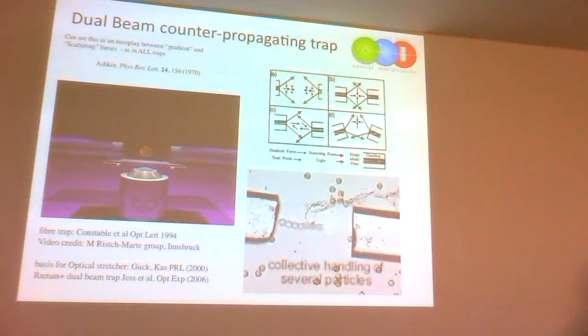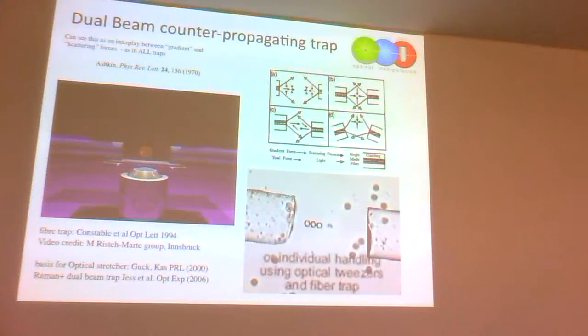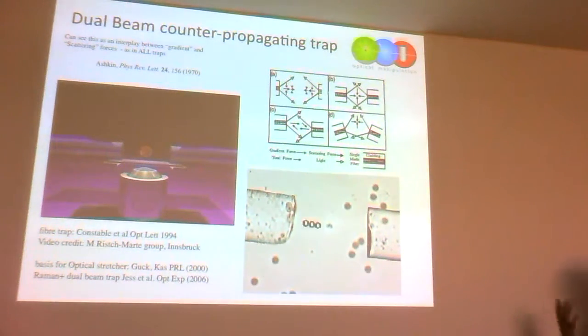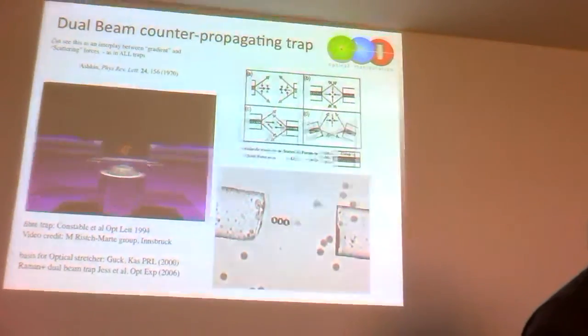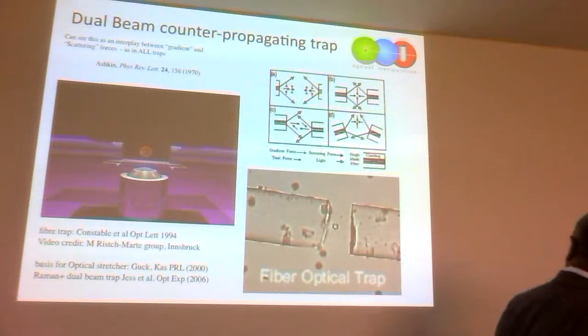Not just because you can do it and publish a cool paper. You do it because the cell will be immobilized away from the surface. You could do a microfluidic flow, maybe related to some of the questions we had earlier. That kind of thing. So that's actually still ongoing as a study. Let me show you what you can do in the bio. Because they're cells, why would they stay stiff? Stay the same.